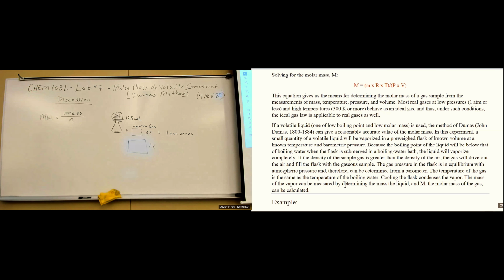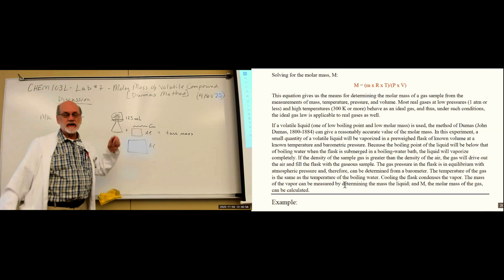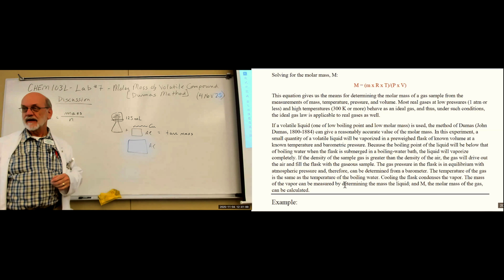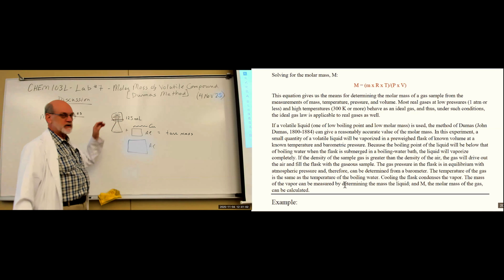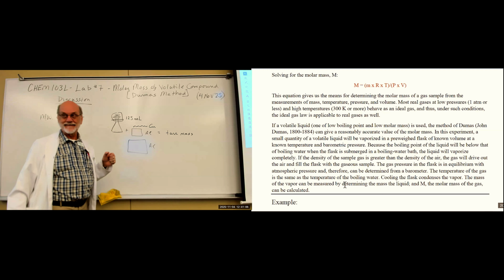Any idea why? You want to make it small so that air doesn't have a chance to come back in. You want that whole space to be filled with vapor from your compound.